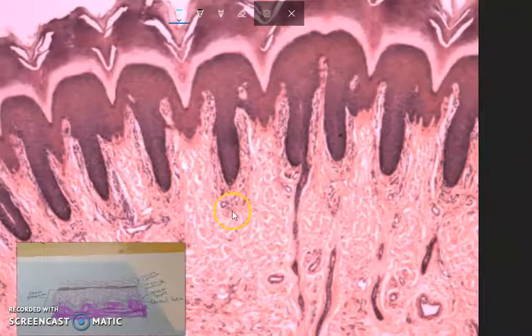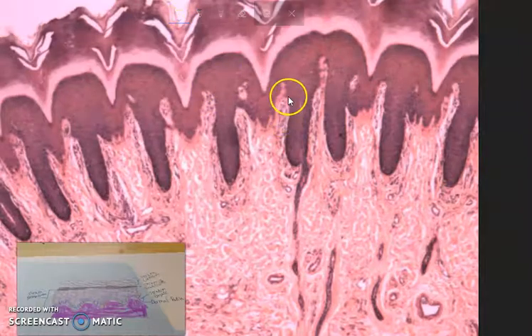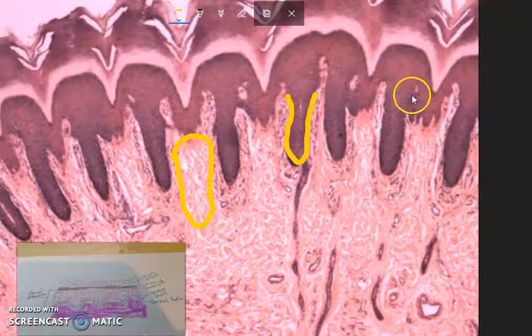So now I also want you to draw thick skin for me. Now on this thick skin slide, we're going to see that we have a lot more pronounced dermal papilla, like that. And you might actually see some Meissner's corpuscles. There's our Meissner's corpuscle hiding out inside of it. And this is a lot less blown up than the thin skin.